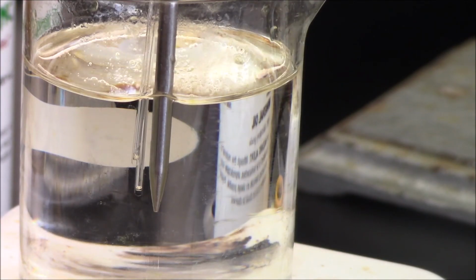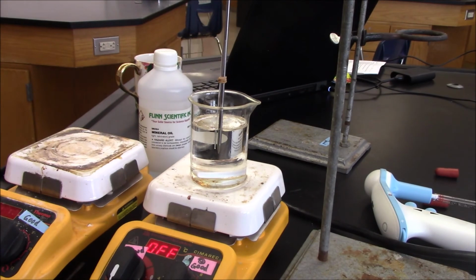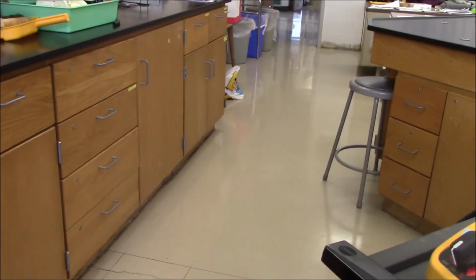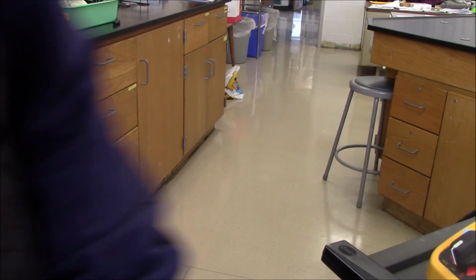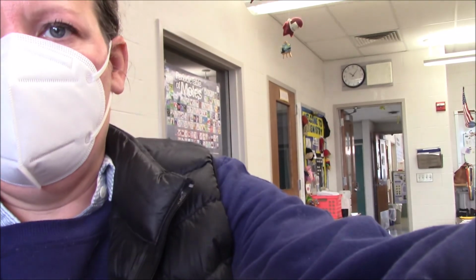Alrighty guys, personal diary time. As you can see here, I have tried twice to do the melting point test, and twice it did not work. What happened really was that it melted over a period of time. I'm going to try and sit down and talk to the camera. It's going to be extreme close-up. There we go. All right. So it melted over a period of time.